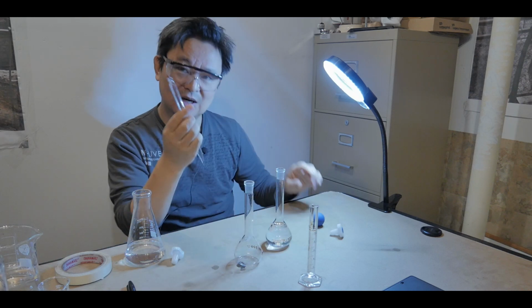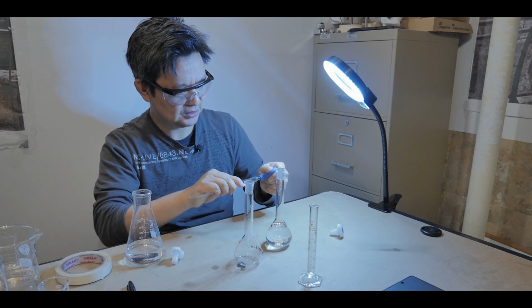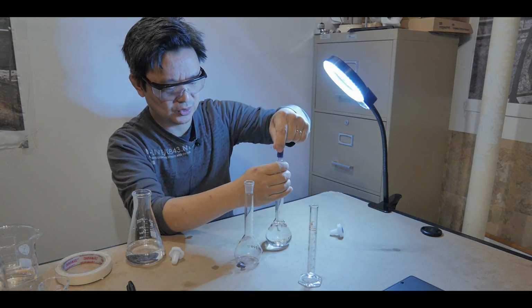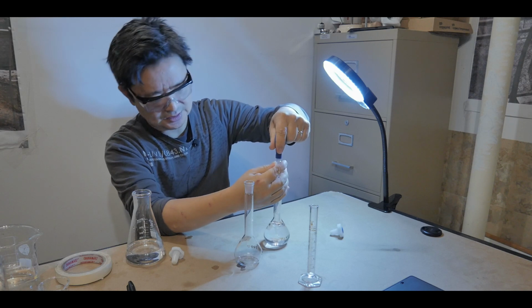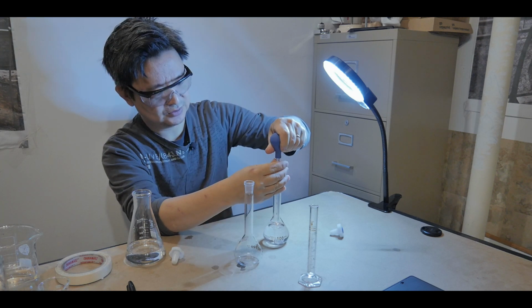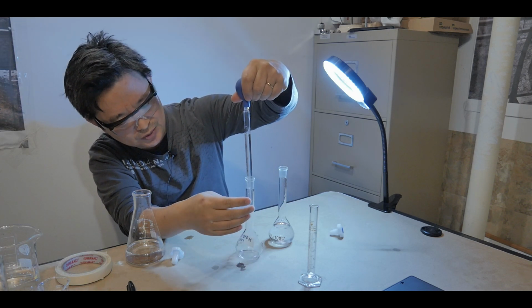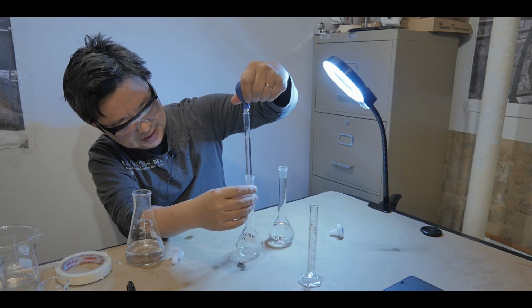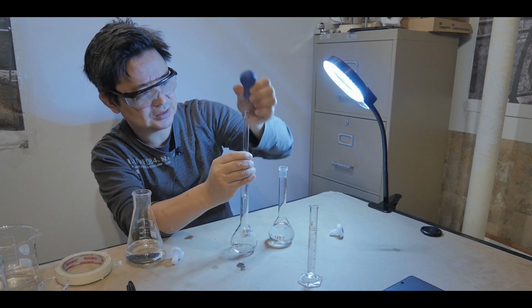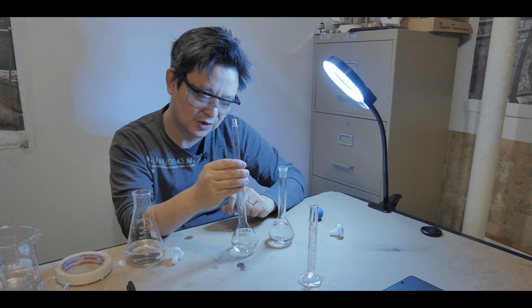What we want to do is grab our pipette with the rubber bulb to suck the liquid out. Okay, make sure you squeeze tightly and then put into your 0.1 molar concentration of hydrochloric acid and pull it all the way to the top. There we go. Okay, so I have exactly 10 mils. Now I'm going to transfer to my 0.01 molar volumetric flask and put that 10 mils of 0.1 molar concentration. Okay. So we have 10 mils of 0.1 molar concentration in the 0.01 volumetric flask.